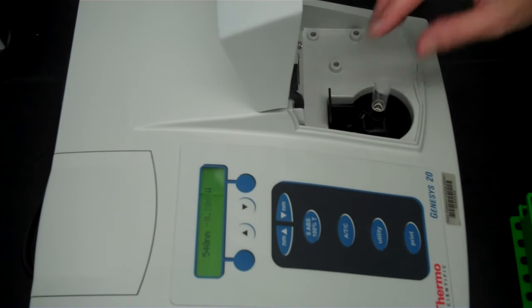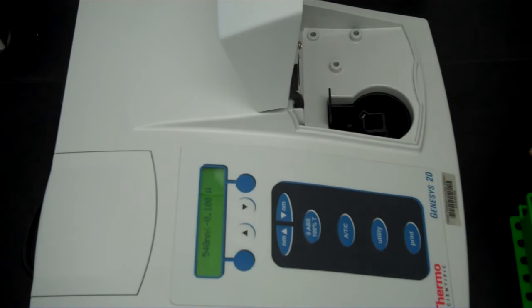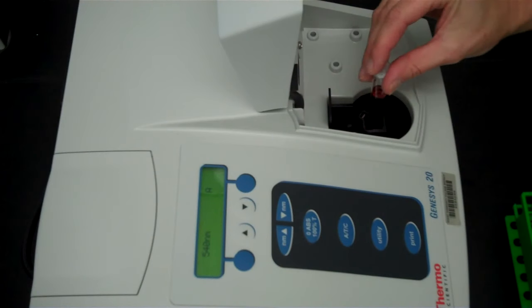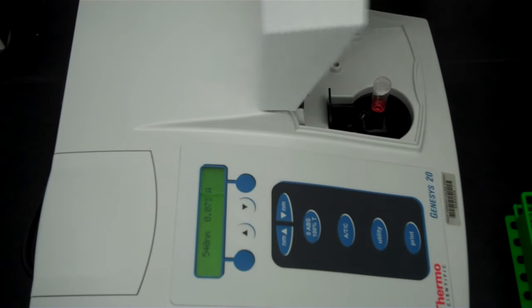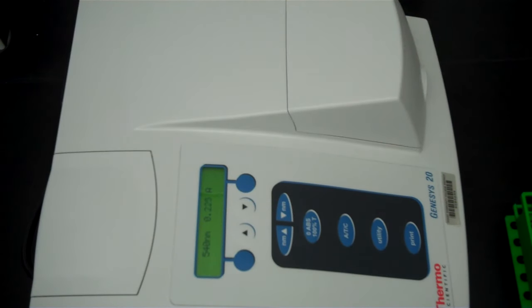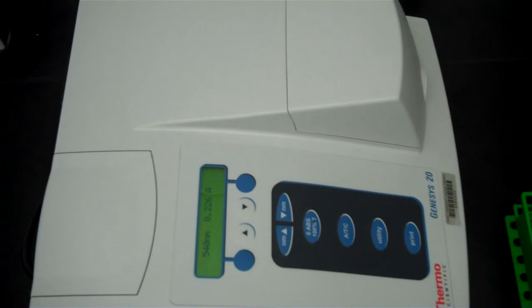So now to read the wavelength of samples you remove the solvent blank, you put in your sample cuvet, close the chamber, and read. In this case it says 0.226 is the absorbance.